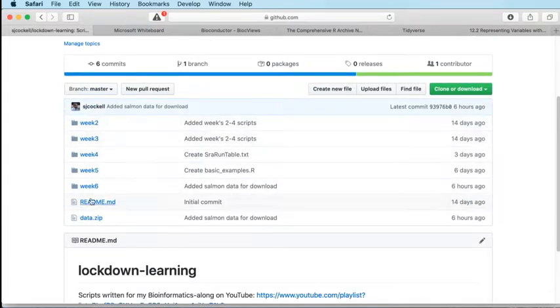And then finally, there is also up there a zip file which is just in the main repository. In the landing page of the repository, there is a zip file called data.zip, which has all of the data from Salmon that I produced locally inside it. In that zip file there are 12 directories containing all of the Salmon data, all of the outputs from my run of Salmon for these 12 samples.